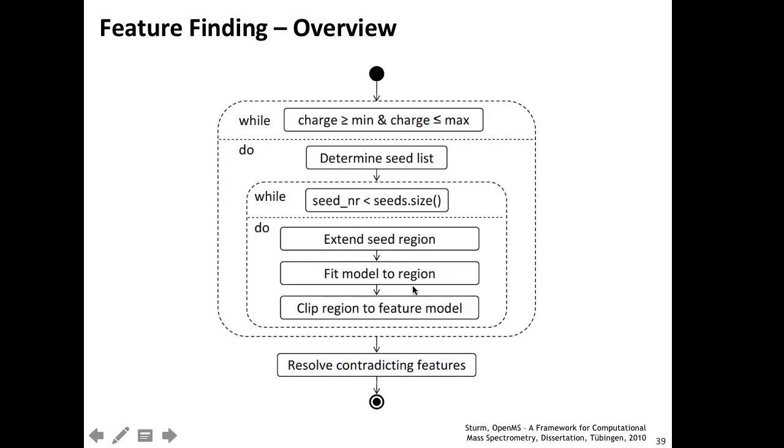Then we compute what model should be expected for a charge state of 2, and that's why we do that independently. If you know you're looking at M/Z 1000 with a charge state of 2, then you need to assume that the model has actually mass 2000. So you compute the binomial distribution for that and try to fit that to all the peaks that you have collected.